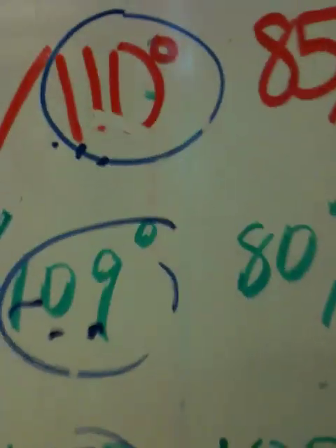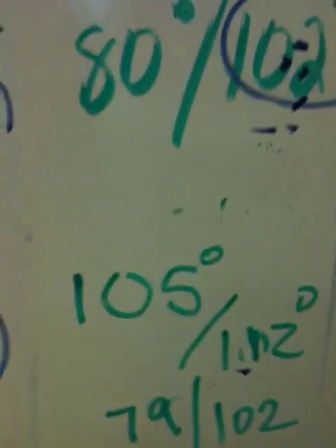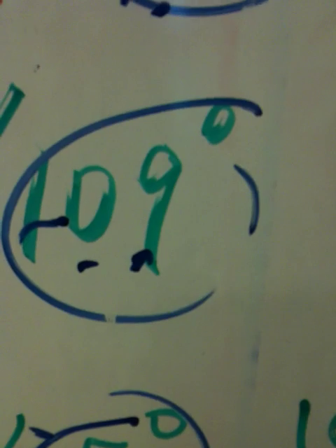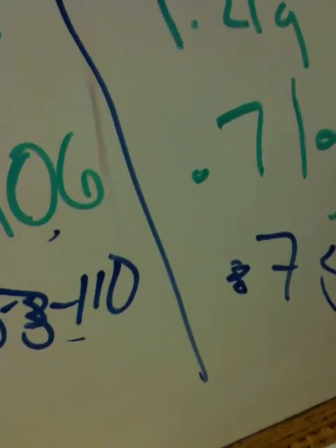Then we looked at A and B data, and I'm just going to show you some typical A and B data here. What we expected for sample A, melting point range, we expected the upper melting point of sample B to be lower than the upper melting point of sample A. Okay, so another example here. This would be very characteristic data. I'm trying to find something that actually falls on the scale here. For example, this one here says 112 as the upper melting point of sample B, 115 for A. This one, it's 102 to 109.